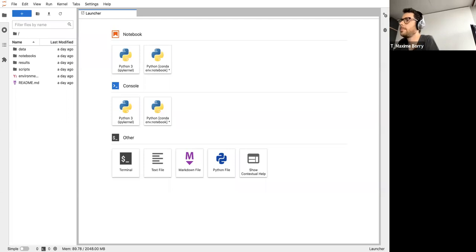So we have a question from William: thoughts as to why damage has a reduced impact? So damage is not binary. It's not whether all of your sequences have damage or not. When you look at this damage plot, you can see the proportion of damage first of all decreases the further you go into the sequence. And even at the first position, usually even in a very degraded sample, you would have 20% of the first bases, the first cytosines, transformed into thymines. 40% if it's very, very degraded, but it means that you still have the majority of your bases that remain cytosines. So you can still assign them quite well.